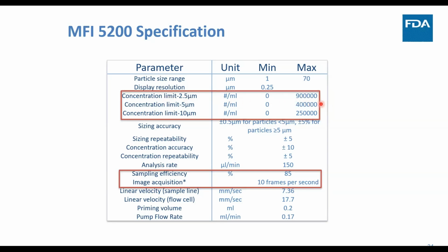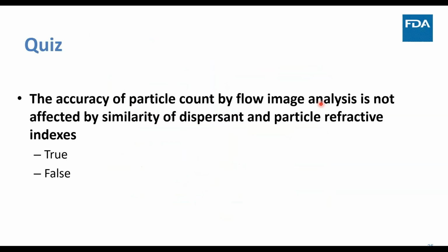As I mentioned, when you're looking at biologics and other products that are prone to forming aggregates, inherent particles, usually you're going to have a very high count of particles of size smaller than 5 microns. And there, you have a big limitation when it comes to light obscuration because of the issue of coincidence error. This would have a lower risk of coincidence error. However, you still would have to think about coincidence error even when looking at this. It's how many particles are in the image. Is a particle hiding behind another particle? The risk is low, but it's not something you could completely discount.